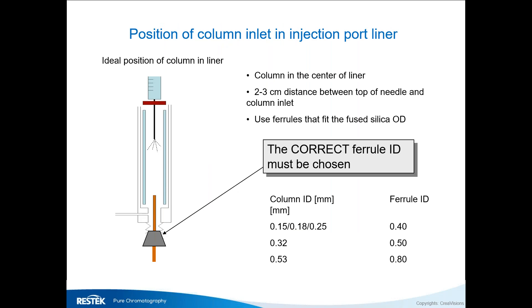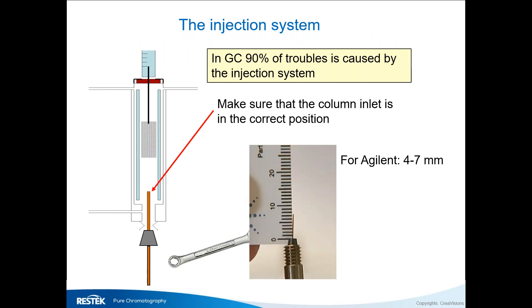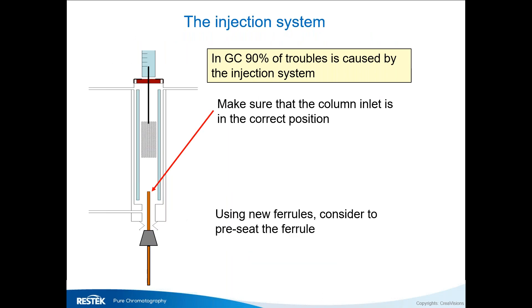You have to make sure you use the right ferrules. The smaller bore columns — 0.15 to 0.25 — have the same OD, so you can use the standard 0.4 mm hole ferrule. Larger diameter columns need a slightly bigger ferrule. Never use a large diameter ferrule for a smaller bore column because you'll have to squeeze it much more, and the column may bend toward the side of the liner, causing wall effects.